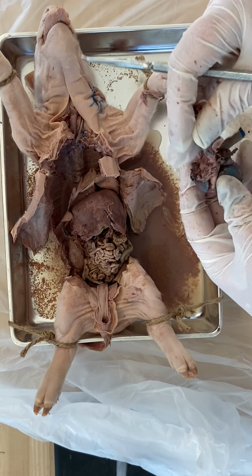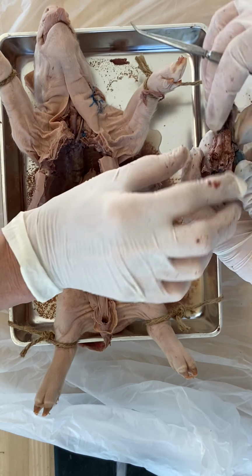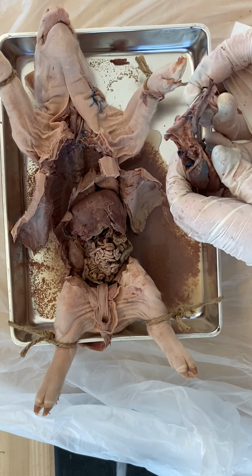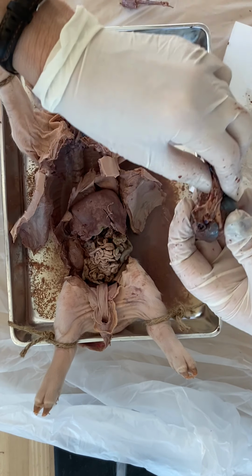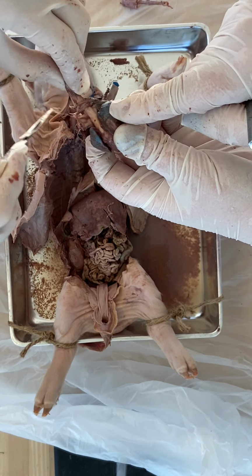Okay, cool. So where are we looking for now? Here's your superior and inferior vena cava, very clear. So let's get the trachea out of the way. We're looking for the aorta, aren't we? Got it off? Yes. Oh, I just ripped the trachea off. Right, there we go.